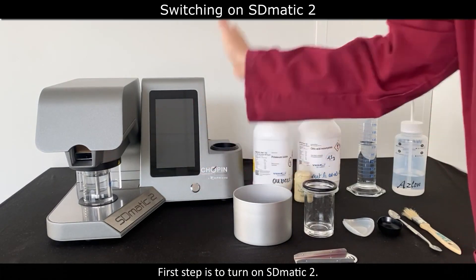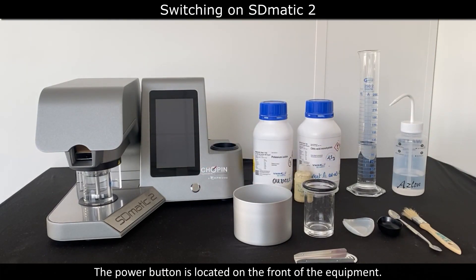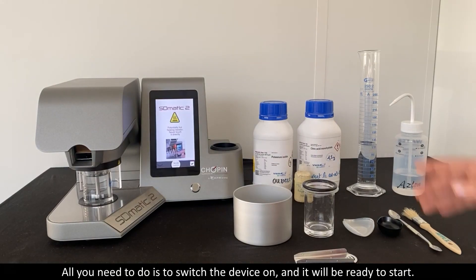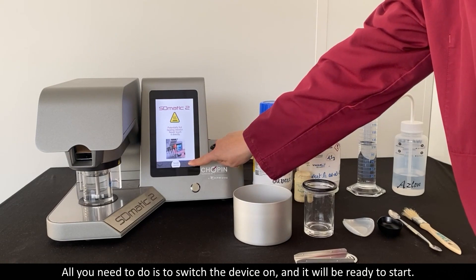The first step is to turn on the S-Domatic 2. The power button is located on the front of the equipment. All you need to do is switch the device on and it will be ready to start.